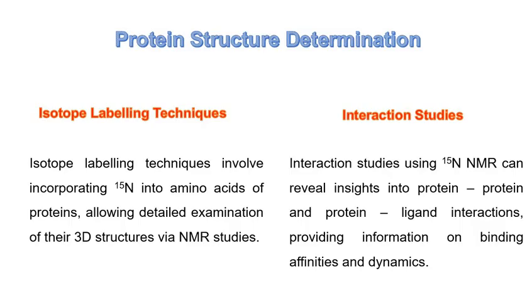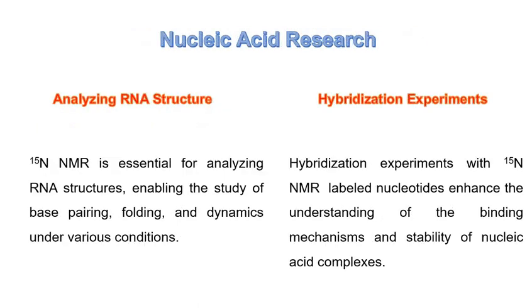The technique provides insights into kinetics and thermodynamics of interactions. It is valuable for studying dynamic interactions in solution without requiring crystallization. Interaction studies using N15 NMR can reveal insights into protein-protein and protein-ligand interactions, providing information on binding affinities and dynamics.